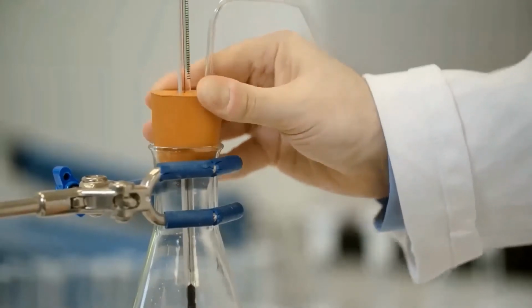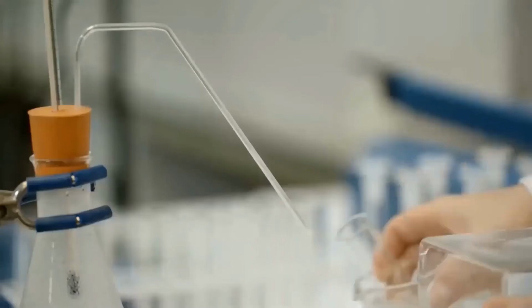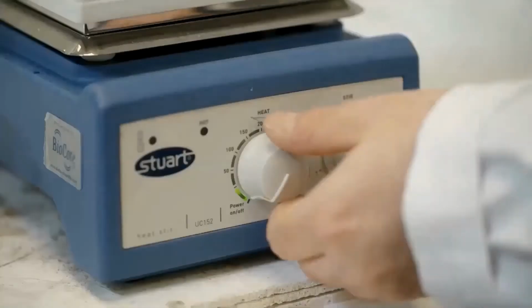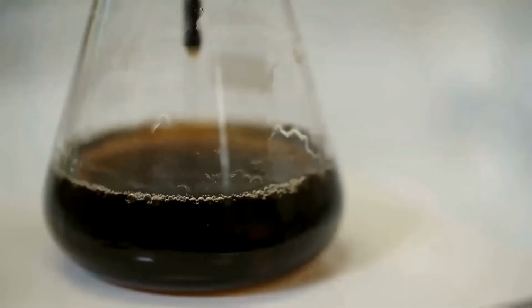To stop the gases escaping, the tubing is securely fastened. The free end of the tube is placed into the lime water solution. Now the hot plate is turned on and the carbonated drink is heated. Bubbles should start to appear coming from the tube and into the lime water solution. Remember, the bubbles which are coming out and mixing with the lime water are bubbles of carbon dioxide gas. And how do you know that? Because you are dealing with fizzy drinks, in which carbon dioxide is the most important factor.